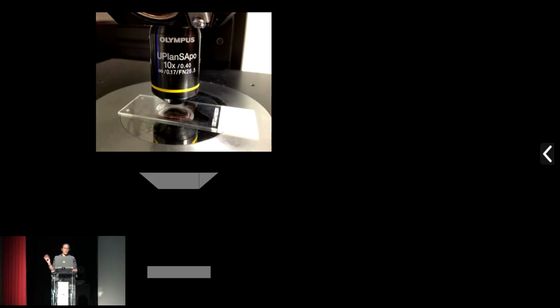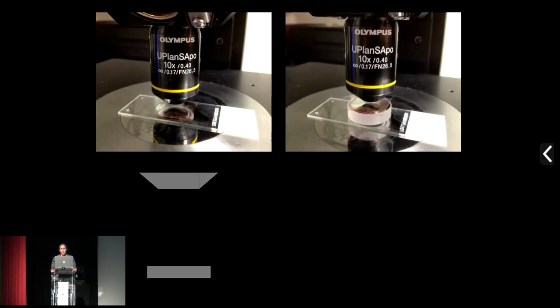We've also used the Mesolens now in interferometric imaging. The standard way of presenting the specimen to a normal microscope, which is not the Mesolens, is to sandwich the specimen between a slide and a cover slip. In our hands in interferometric imaging, we mount the specimen directly onto a mirror. And what we have then is an incoming illumination ray. It's reflected from the mirror. The specimen normally sits about here.